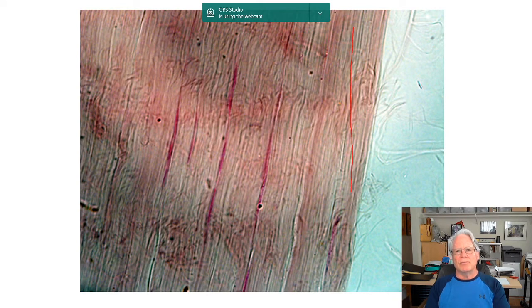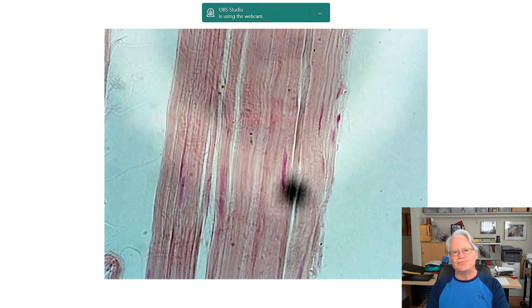Same thing here. In this case, the fibers are running in this direction. Okay? You can see the same basic pattern. These areas would be where the fibroblasts are. So there's a fibroblast. And not quite the same sort of river of worms, but the pattern is there. Everything parallel, everything parallel. Okay. Same thing. Here's my cells. Those are the fibroblasts. Okay. And then I get my fibers all running parallel to each other. And you can see they're quite densely packed together. So dense, regular, connective tissue.